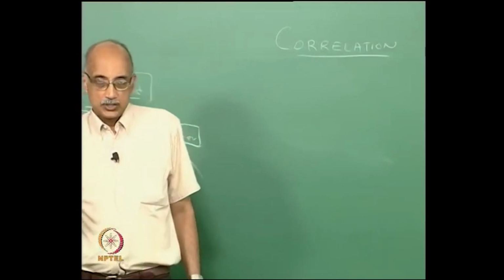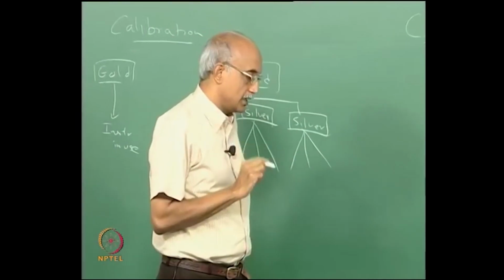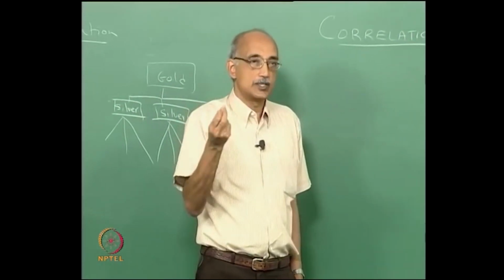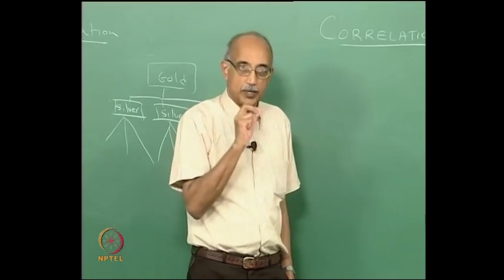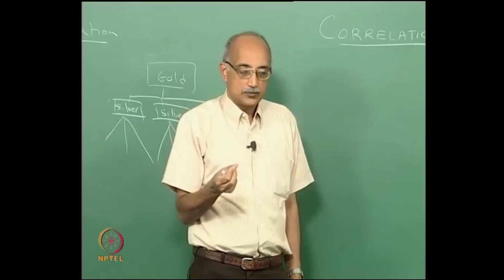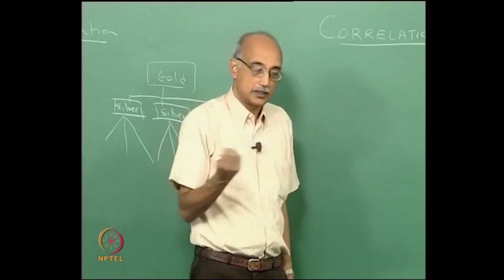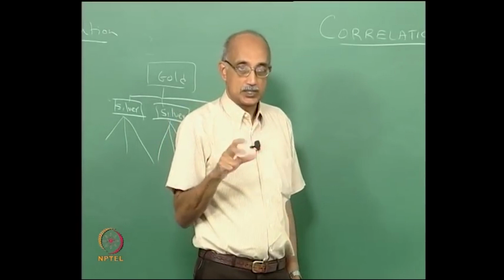The difference between calibration and correlation is very subtle but very important to understand. Calibration is really a measure of the instrument itself. For example, if you are using a laser based light scattering instrument, it is a measure of how stable the laser is. Is this laser starting to lose its life? Is it starting to drift? So, it is very equipment focused. Correlation, on the other hand, is procedure focused, because when you are using a laser particle counter to measure size and count, the instrument itself is doing its job. The optics are collecting the signals, the software is processing the data and so on, but the preparation of the sample is still in your hands.